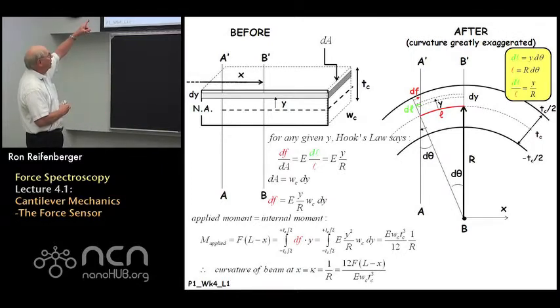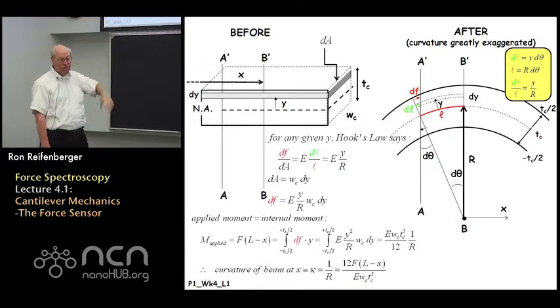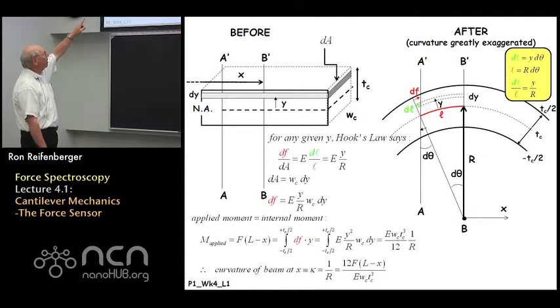And so you can then write down an equation that says the forces applied along any slab Y, these internal forces that are going to be the internal forces between atoms inside the spring, divided by the differential area dA, indicated by that shaded rectangular slab, has got to be equal to the elongation delta L of the beam divided by the length of the beam.